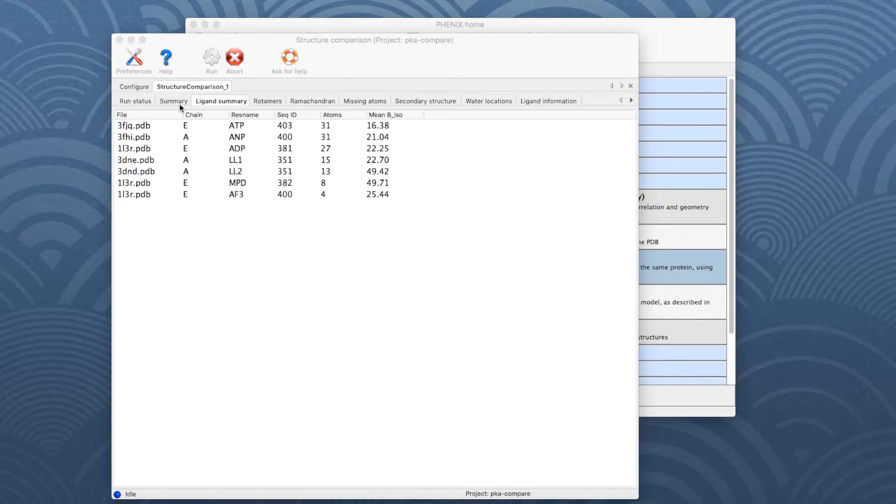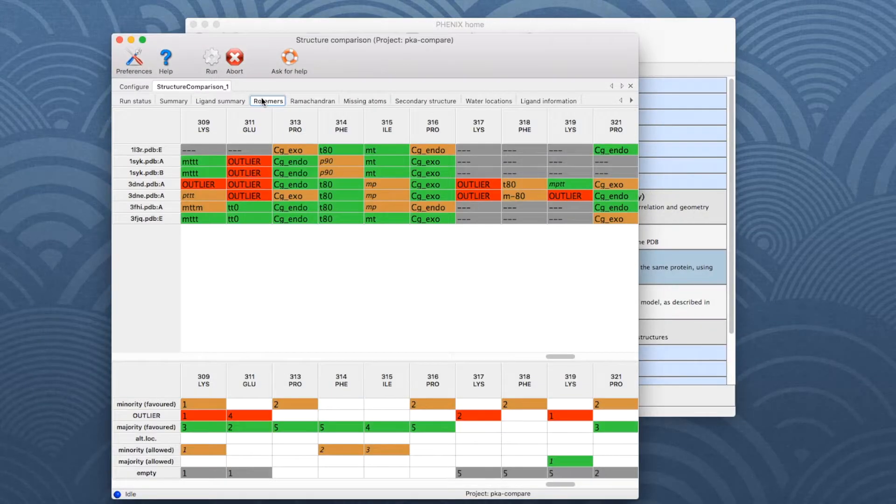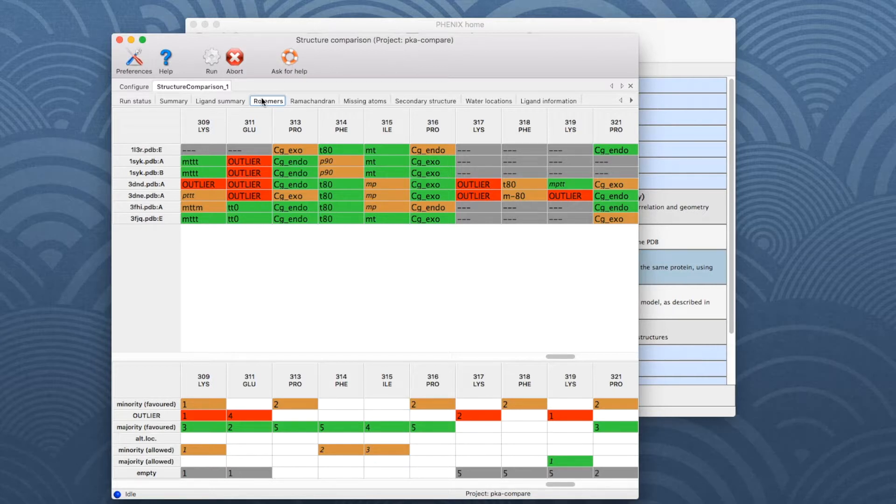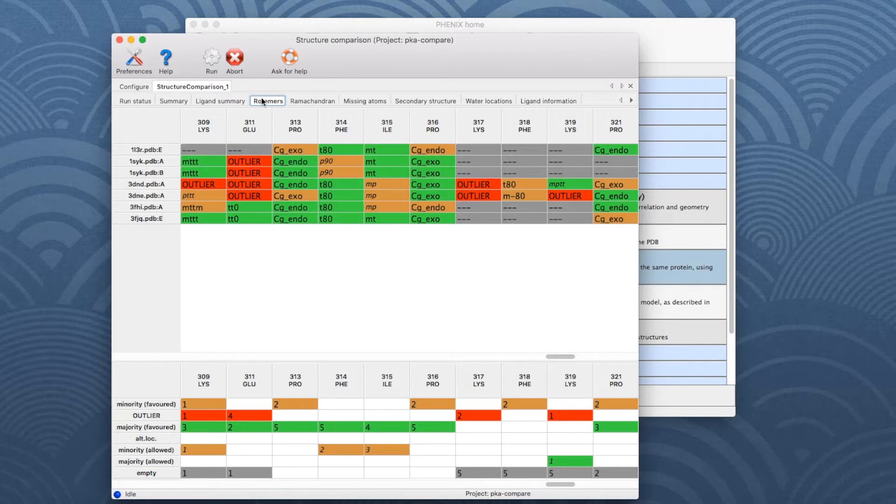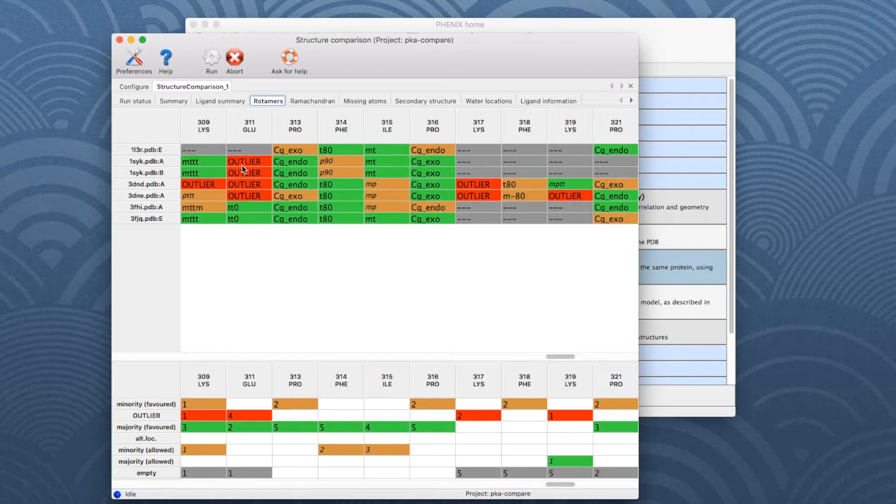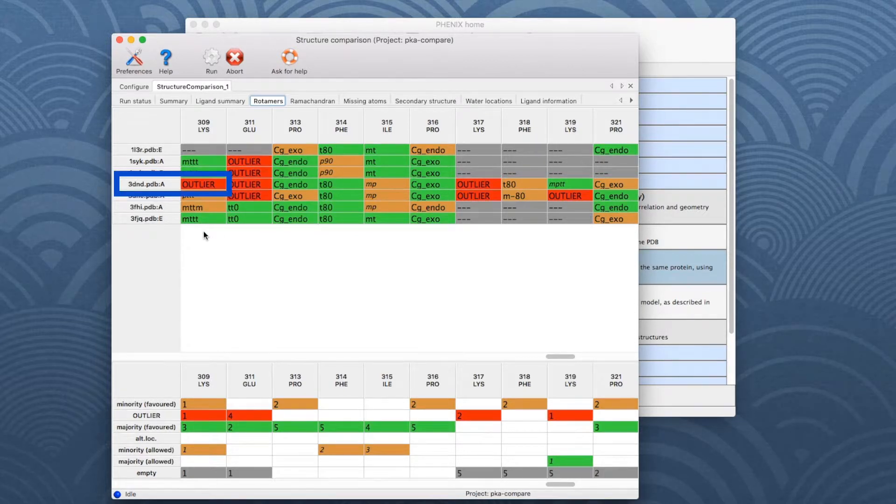The next table shows the rotamer angle differences. Any set of equivalent residues with multiple rotamer classes or outliers will be displayed. Let's have a look at residue lysine 309. The rotamer is identified as outlier, highlighted in red, in model 3DND.